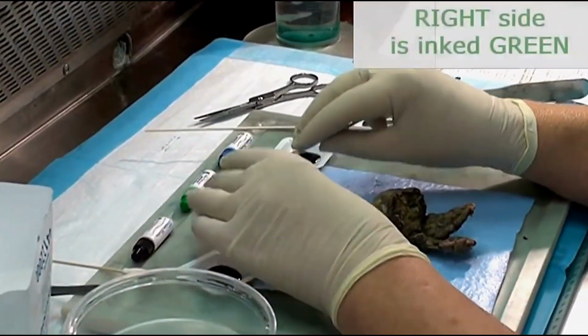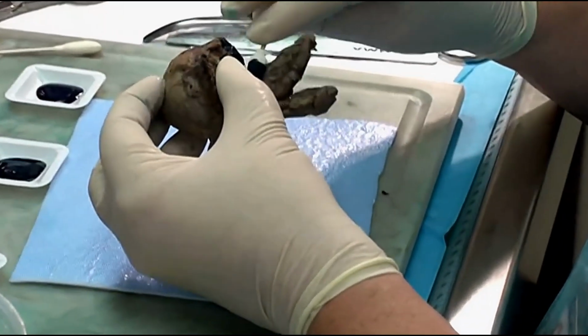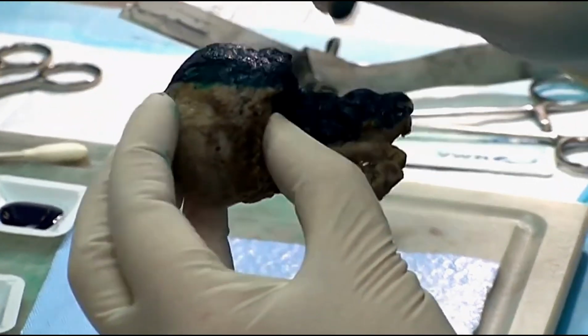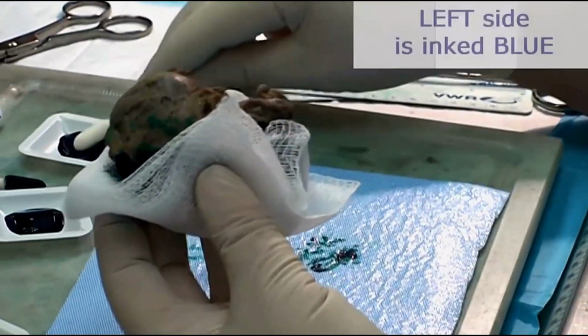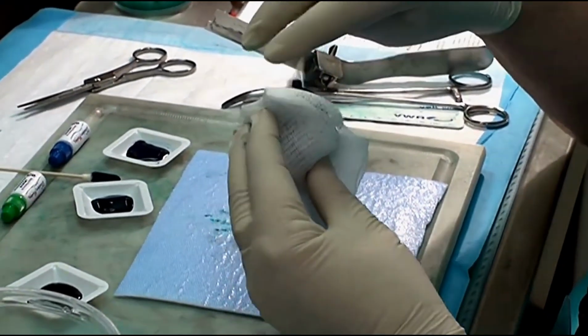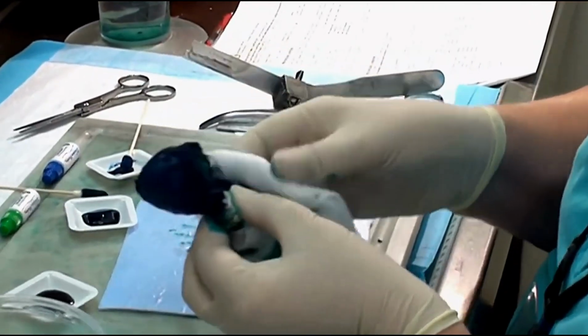And the first thing that she's going to do is to ink the whole specimen with India ink that is going to be blue in the left half of the prostate, and then green in the right side, trying to separate these two colors.